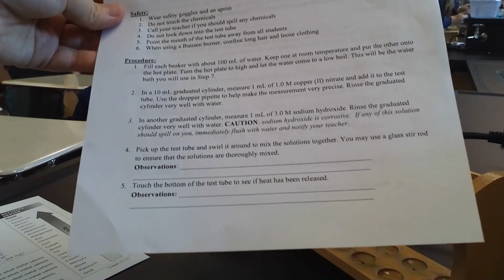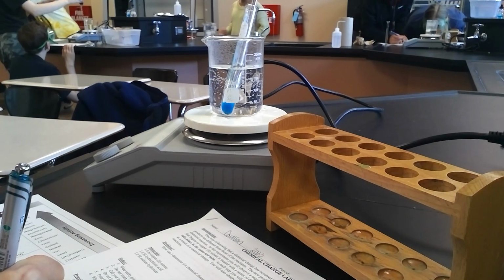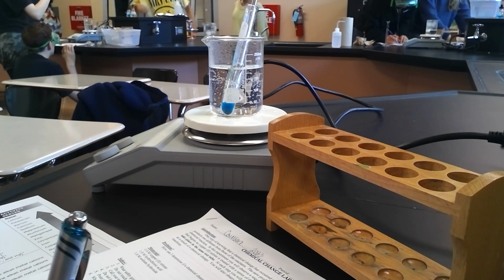So our observation for number 4, I would say, is darker blue and chunky. Chunky precipitate.